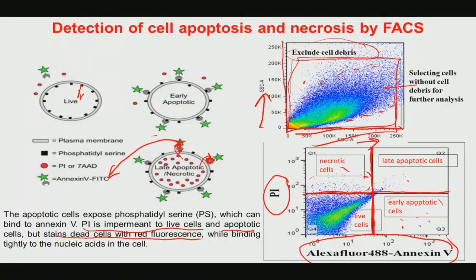So, all the dots which show large propidium iodide expression essentially are not alive, and they are necrotic cells. So, each time you use this kind of fluorescent FACS analysis, these plots are to be meaningfully analyzed, so that you can extract quantified results to tell what fraction of the cells are live or what fraction of the cells are in the apoptosis stage.